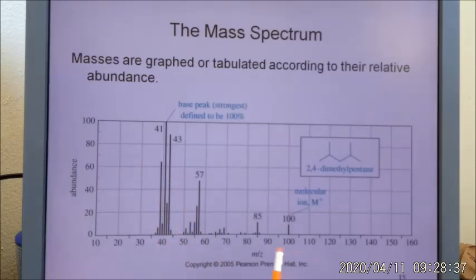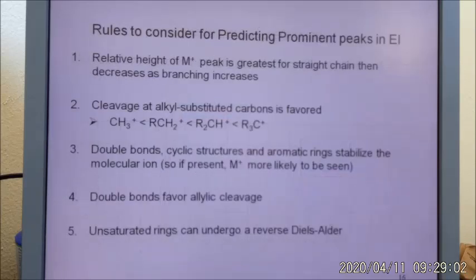So, can you assign every single peak? The answer is no. Sometimes you just get random rearrangements, and so some of them you won't be able to explain. But we're going to talk about the ones that we can recognize as a pattern for certain groups that are in your molecule, and others where, like we were talking about, the loss of your methyl, loss of your propyl group. Okay? So let's see some of these rules.